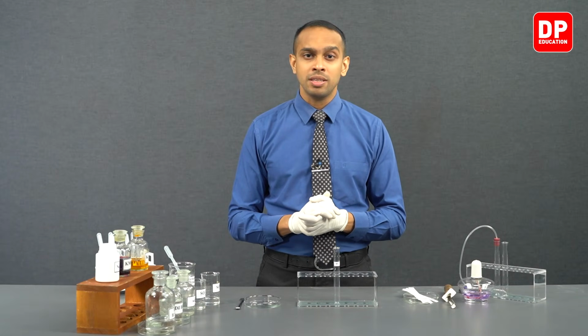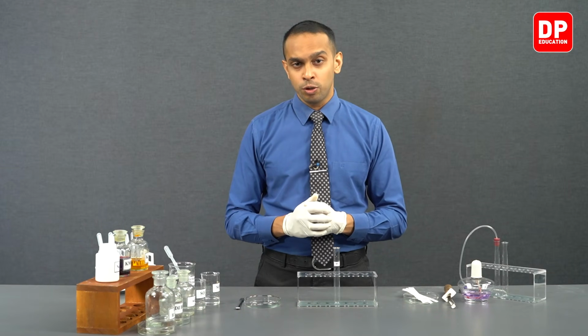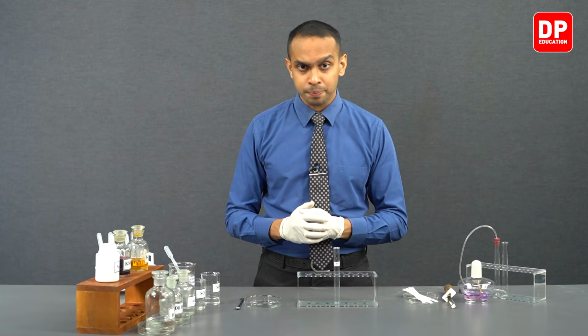As they react, it will release sulfur dioxide gas, and you can very clearly observe the formation of sulfur dioxide gas through its pungent smell. You should not be inhaling this, it's an irritant gas. So you should be conducting this experiment in a fume hood or a well ventilated area.